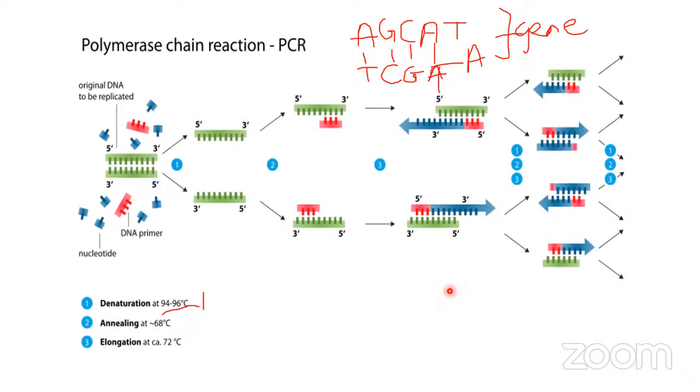For these purposes, are primers reusable? No, they are not reusable because you have already added them into the reaction, and if they find a complementary gene, they will amplify it. But if they don't find it, they will not be involved in the reaction. During the period when you're amplifying, the primer is also going through a process to see if it can find a complementary sequence to bind with. And if it does not find one to bind with, that's the end of the reaction.